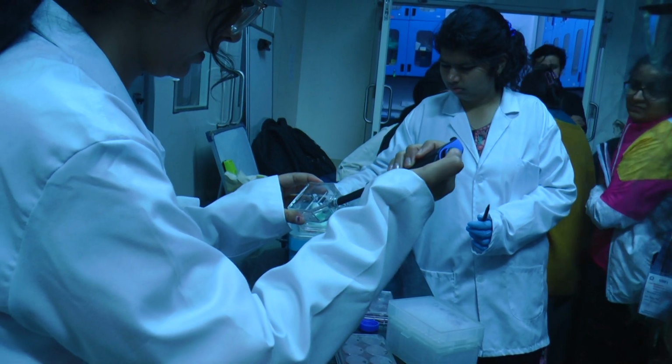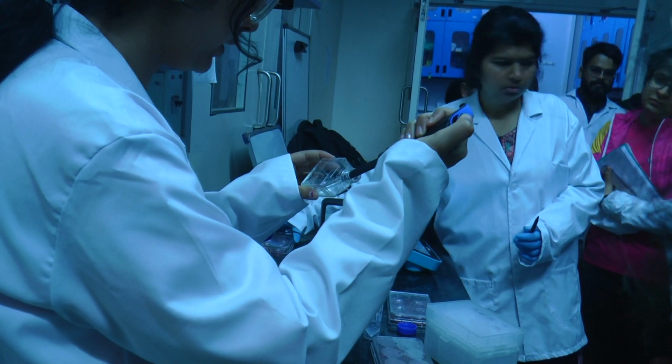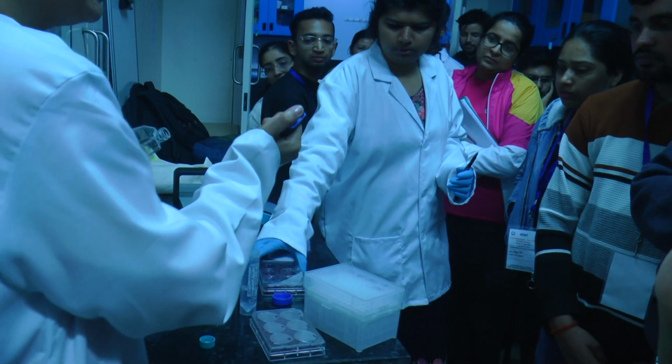So now you're removing what's on top as well. Yes. So now we are left with only the adhered cells, without any cell debris.